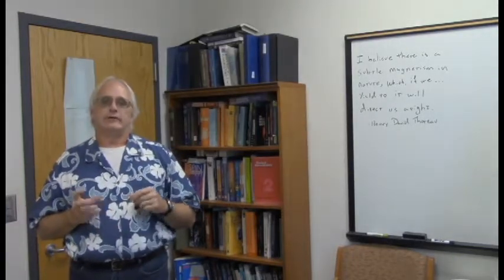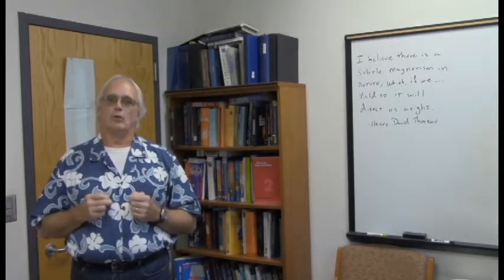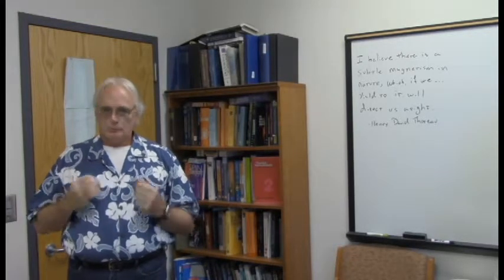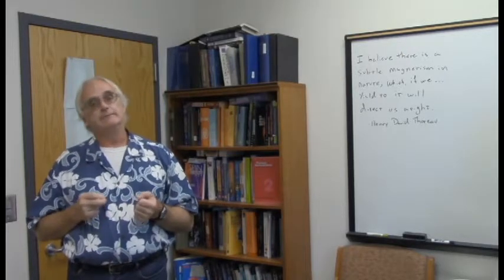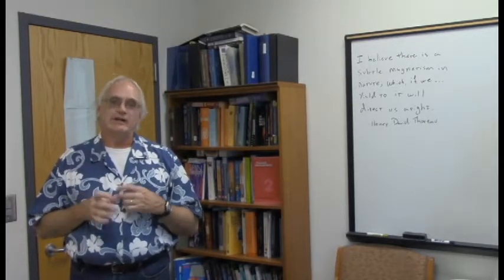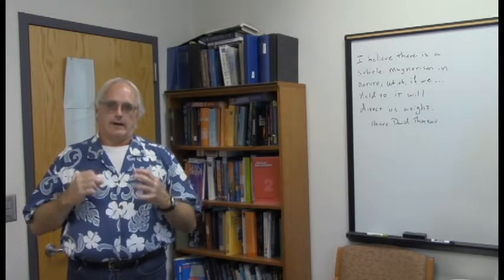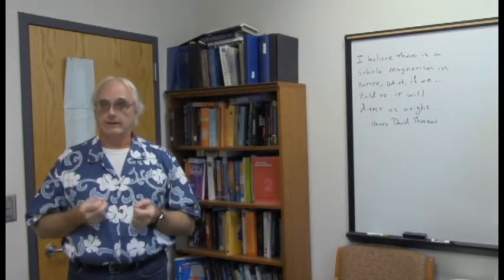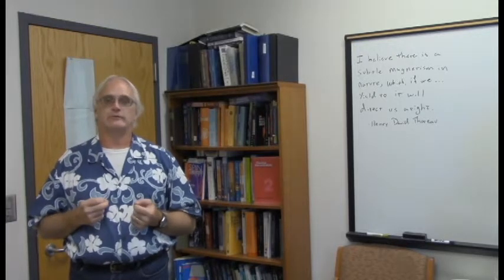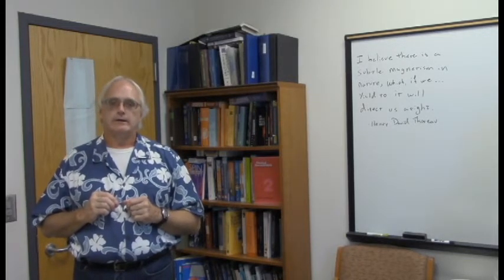Together, I hope that this shows you a little bit about how to use COSY and HSQC to learn more about molecules. They are, on modern instruments, fairly easy to obtain. They don't take terribly long. To be honest, I think they're a little underused in teaching students about the power of NMR and what it can do for us. They are marvelously useful experiments, very often in putting together structures of unknowns or confirming structures of molecules that we think we've extracted or synthesized. Hope this helps. Take an opportunity to practice a few of these, and talk to you later.